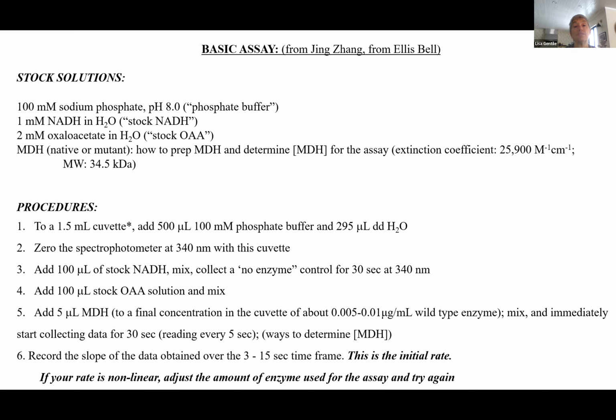Again, oxaloacetate seems to be pretty finicky. And so if you've got an afternoon lab that starts at 1 o'clock, this is not a solution that you want to make up at 8 o'clock in the morning before your classes start. This is a solution you want to be making up at 12:50 right before you walk into your lab. Keeping it cold's a good thing. If you see that your data is deteriorating over the course of the afternoon, it may be a stock solution that you've got to make up again. So the oxaloacetate is going to be the finicky one in these stock solutions.